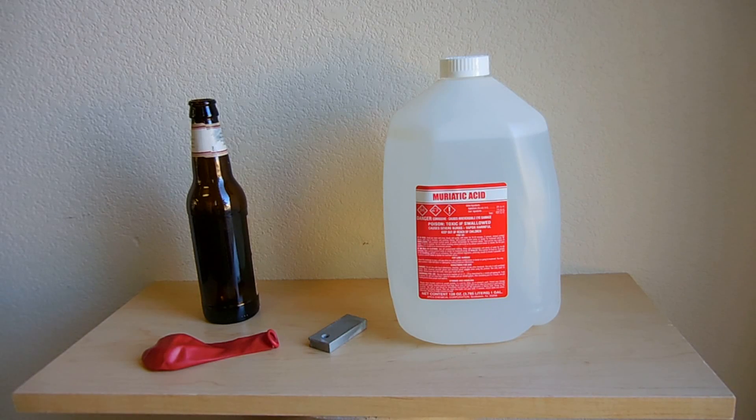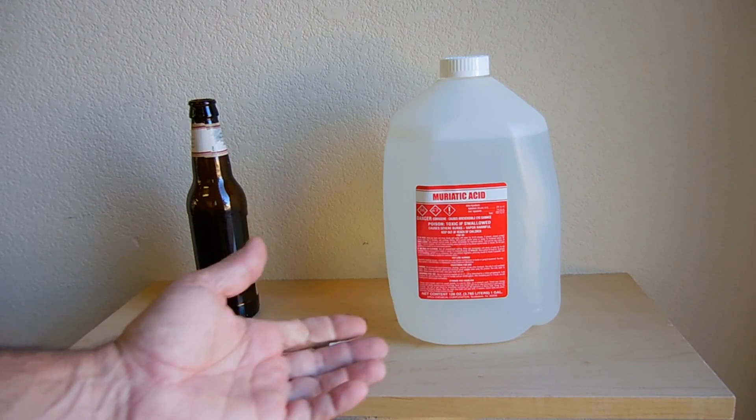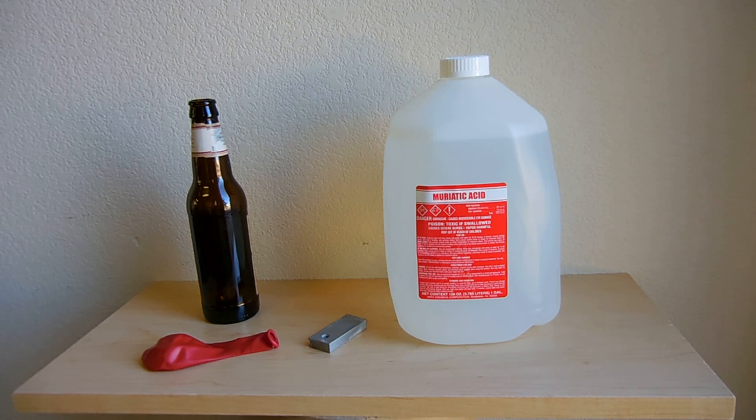In this video I'm going to show you how you can make hydrogen gas using items readily available at Walmart or Harbor Freight. Keep in mind that the hydrogen gas you're going to be producing is going to be of high concentration, but it's not going to be super high purity.